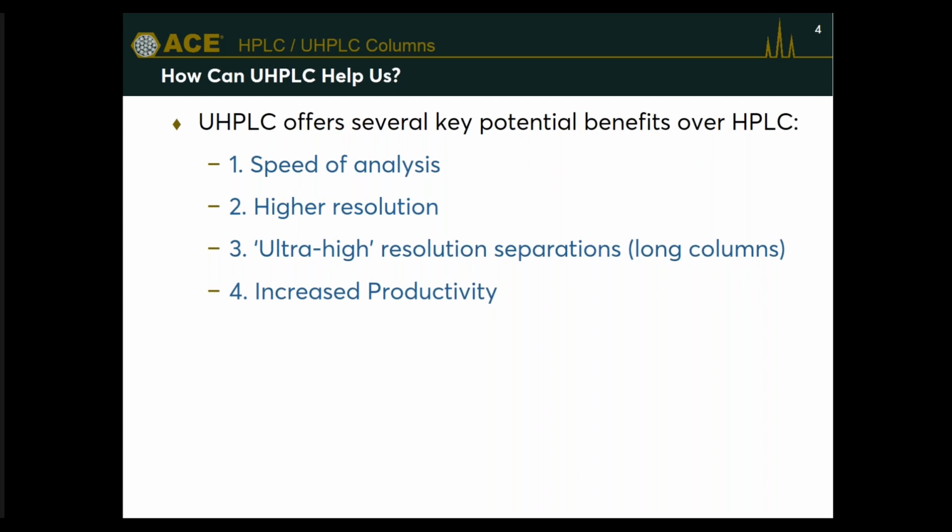We can do ultra high resolution separations with longer columns, which I'm going to give a nice example for everybody to see. And then also, of course, all of these things come together to give us overall an increased productivity of the analytical laboratory. That might be in time, but also in solvent saving, cost savings, and so on.